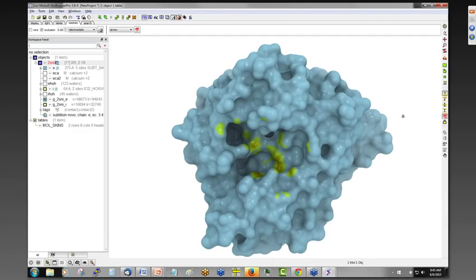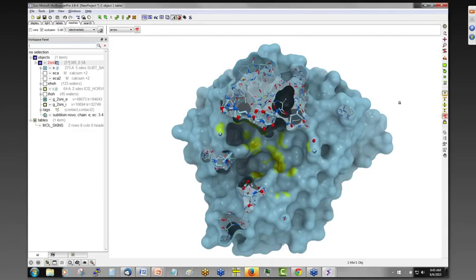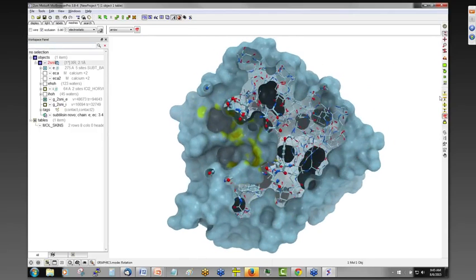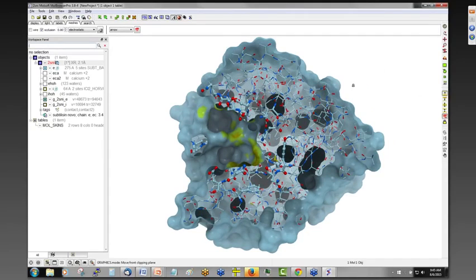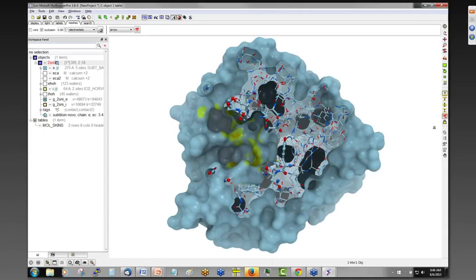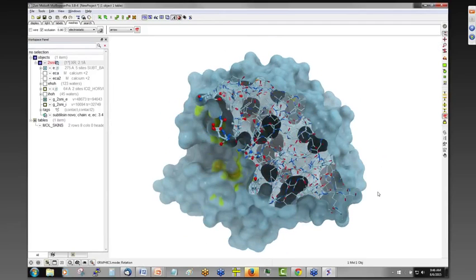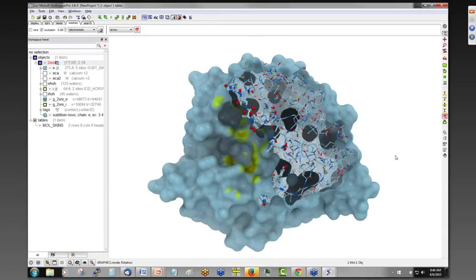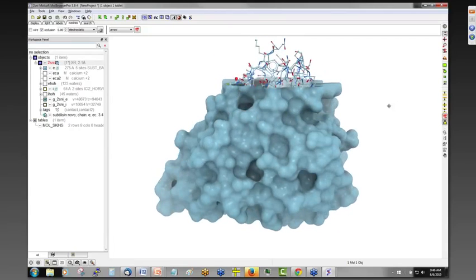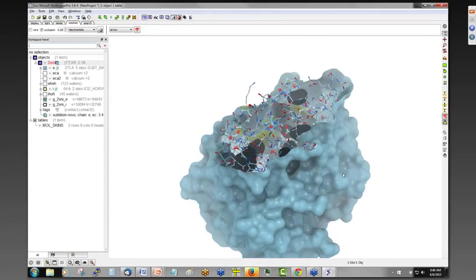If you select it, then if you cut away now, you see that it's not cutting away the actual representation of the structure, the wire. It's just cutting away the skin. If you make a nice cut and you want to lock it, so basically now if I rotate, it's going to make that same plane cut through the molecule wherever I rotate. But it might be nice to lock it at this point. Click a lock button here, and then if we rotate it, we can show it in this representation.